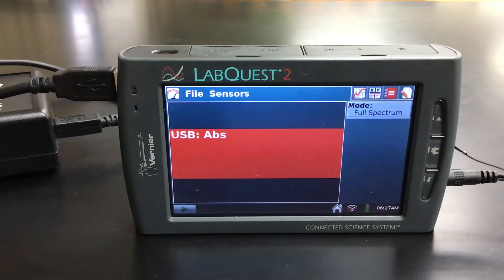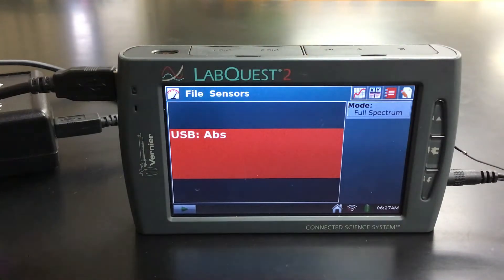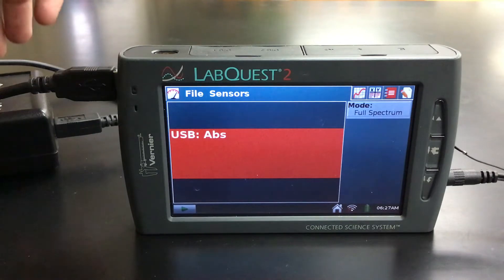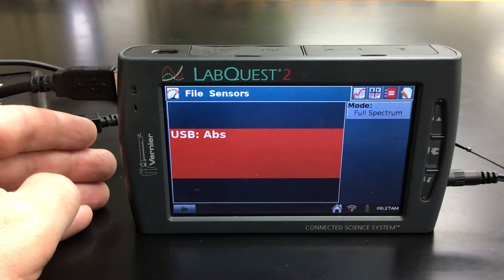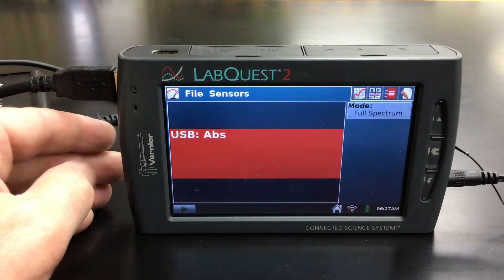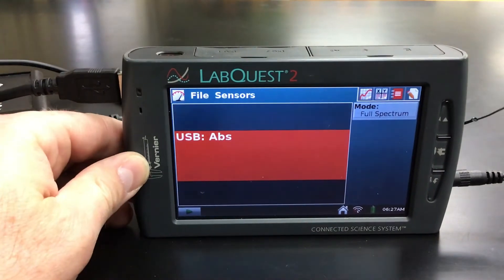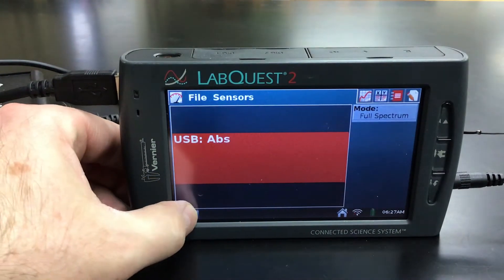Our first step is going to be to set our wavelength that we're going to collect our data. I've got a cuvette here of our Crystal Violet. Put that into our SpectroVis. And then we are going to set our wavelength here. The method says to set it at about 590 roughly. So we're going to go ahead and collect our data. We're in the full spectrum mode, which is the default mode.